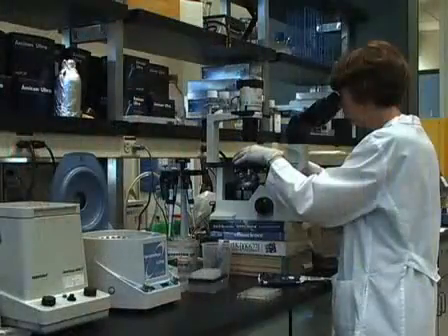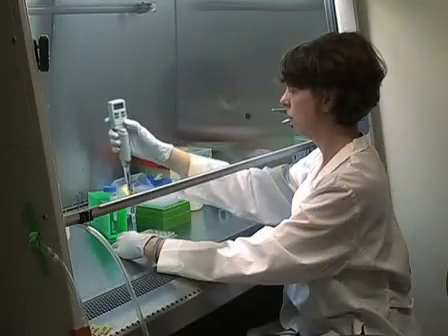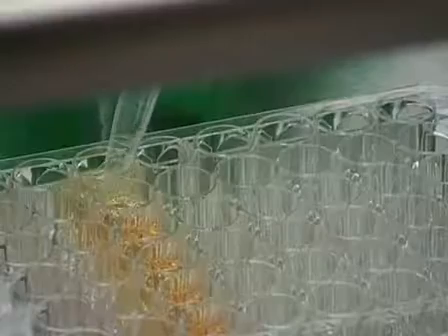What would you say are the most difficult or challenging aspects of this assay when it comes to replicating it in other labs? Well, as I think about it, there's really two. The growth of the T cells is something that really is a bit of an art. You have almost daily decisions as far as whether the cells need additional nutrients or additional space to grow.